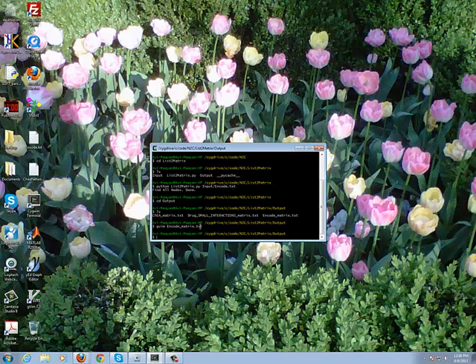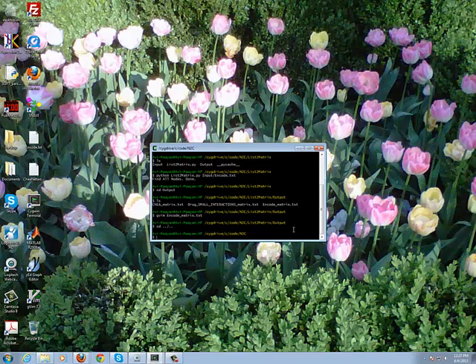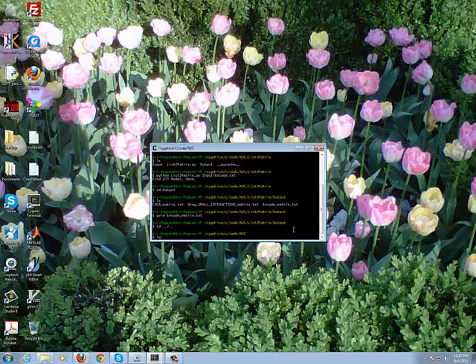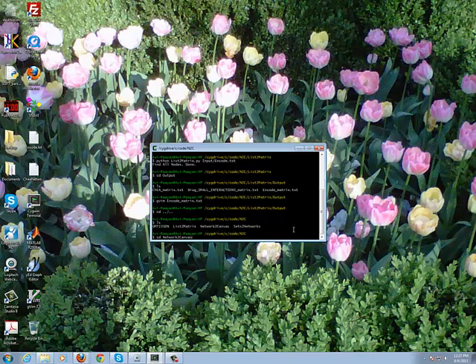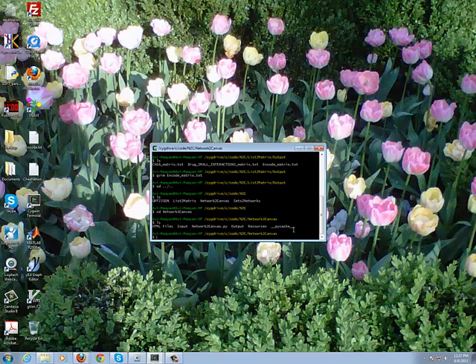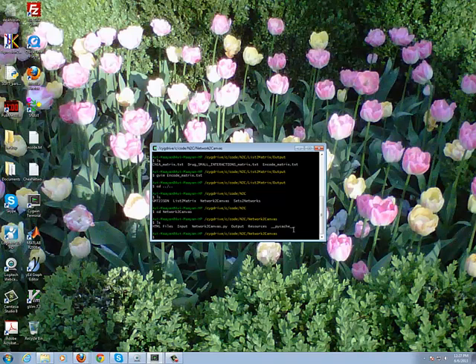So now once we have this file encode_matrix.txt, we can use that as an input to the network-to-canvas script. So if we go up two levels, we need to go into the network-to-canvas directory. And let's see what we have there. Again, we have input and output folders.